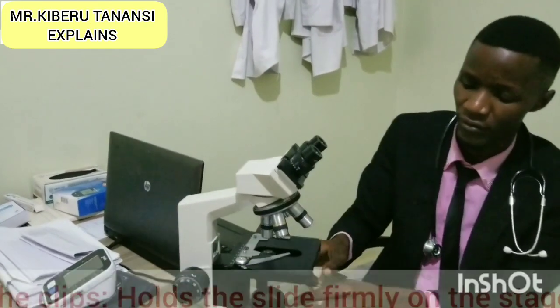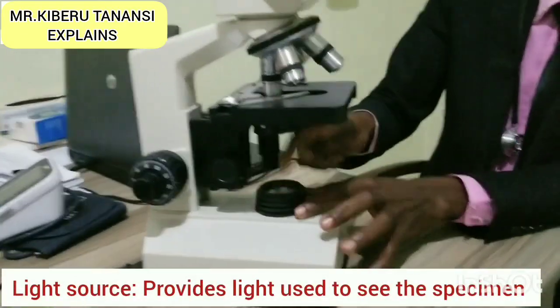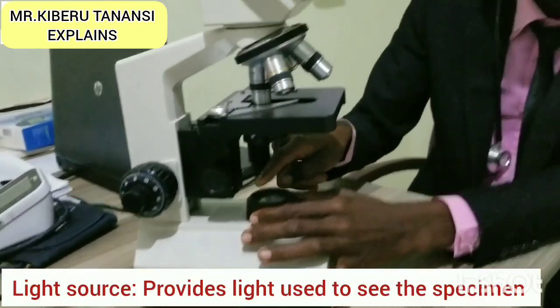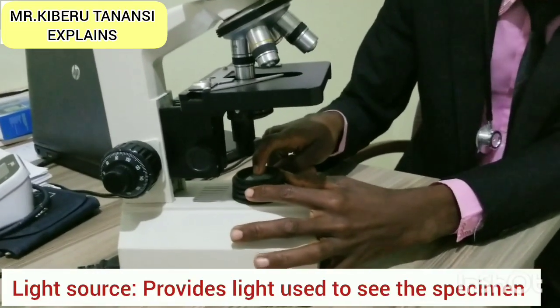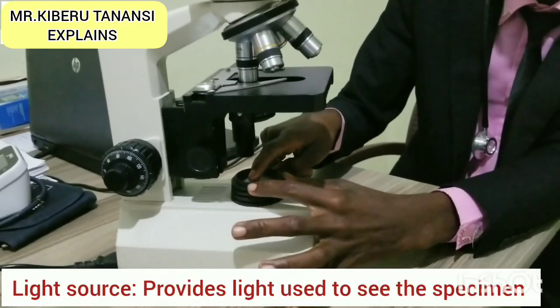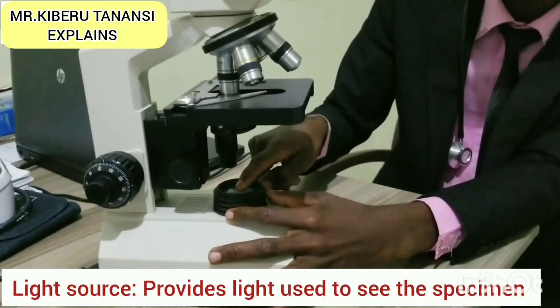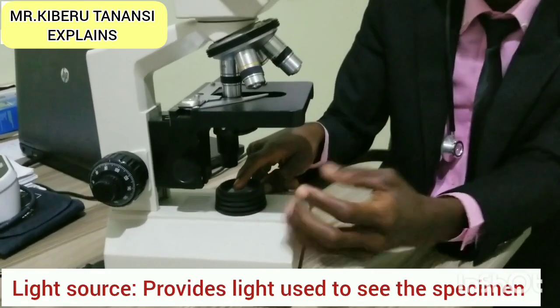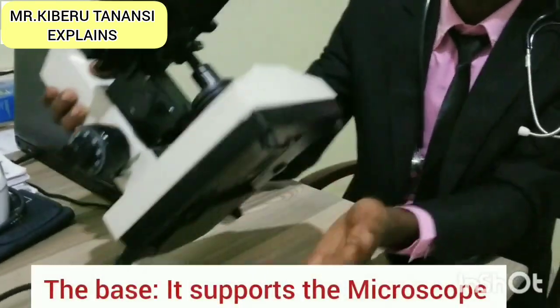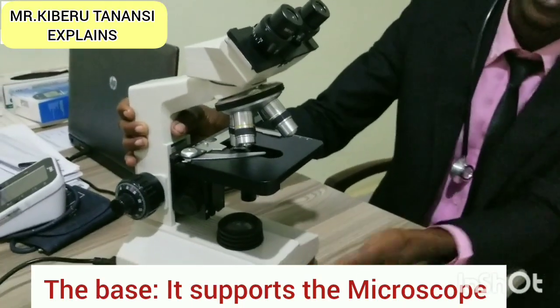From there, down here, we have the light source, the source of the light. This is the bulb. Here in our modern microscope, this one is a bulb. But in the other local light microscopes, they used to put a reflecting mirror here, but for us we have a bulb here which gives off light. So this is the source of the light, and down here is the base. This one is the base onto which the microscope sits. So this is the base.